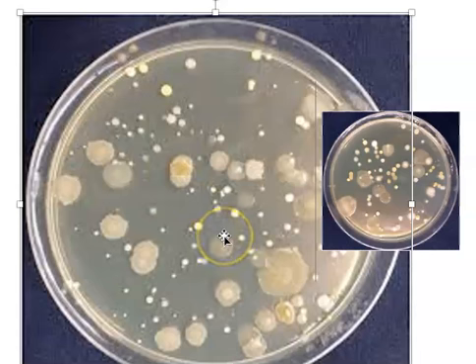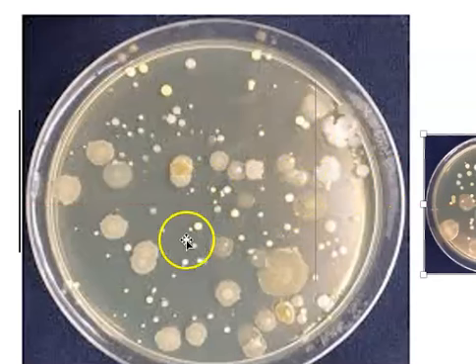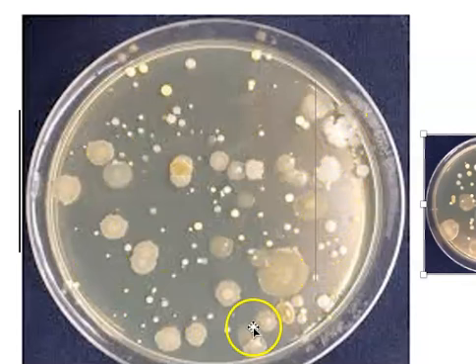If you look at this plate, you can definitely see that there are different types of colonies here. They're not all the same. They're not all identical. Some of the things to notice, obviously, size. So I've got some colonies growing on here that are quite small. I've got others growing that are quite large. I've got different colors growing here. The edges of the colonies look all different. Some of them are smooth and even. Some of them are jagged. I've got some colonies that just look bizarre. They have really undulating margins, very strange shapes.